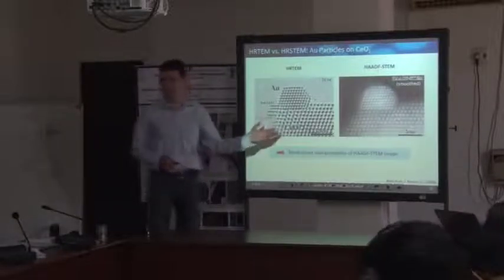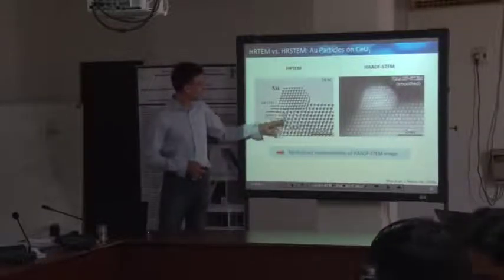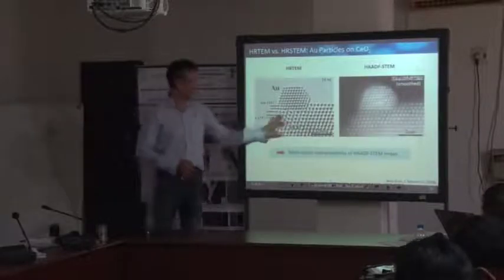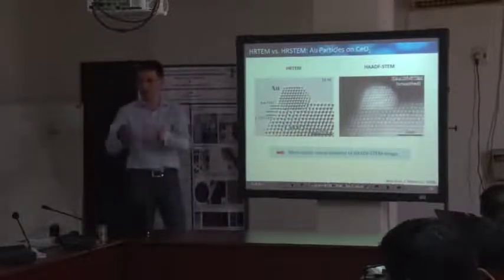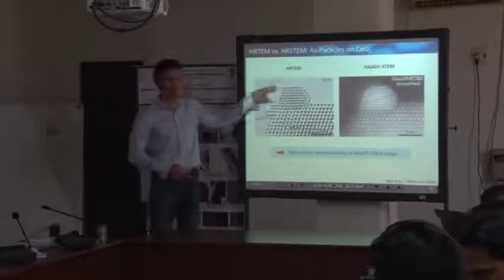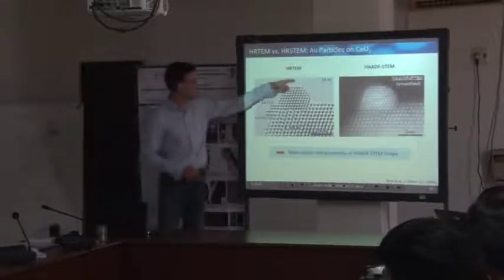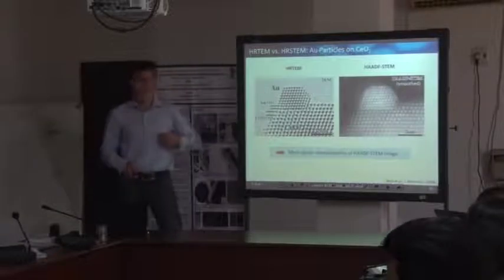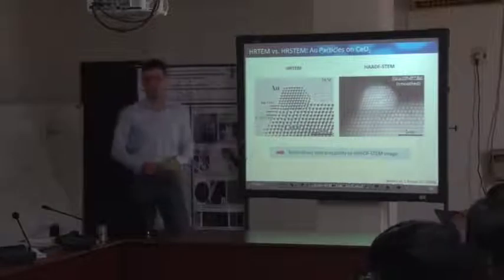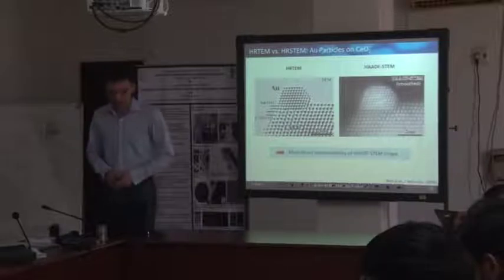This is an HRTEM image that you got to know yesterday. Here you already see that there is some misalignment of the crystal. So this is not a clear image, is it? Where the atomic columns are, as you know, is a little challenging. There are also some delocalization effects because this is a non-aberration corrected HRTEM image. We see those fringes of our diffracted beams which don't superimpose right in the area where our crystal is. This is just a nanoparticle on a ceramic support film.